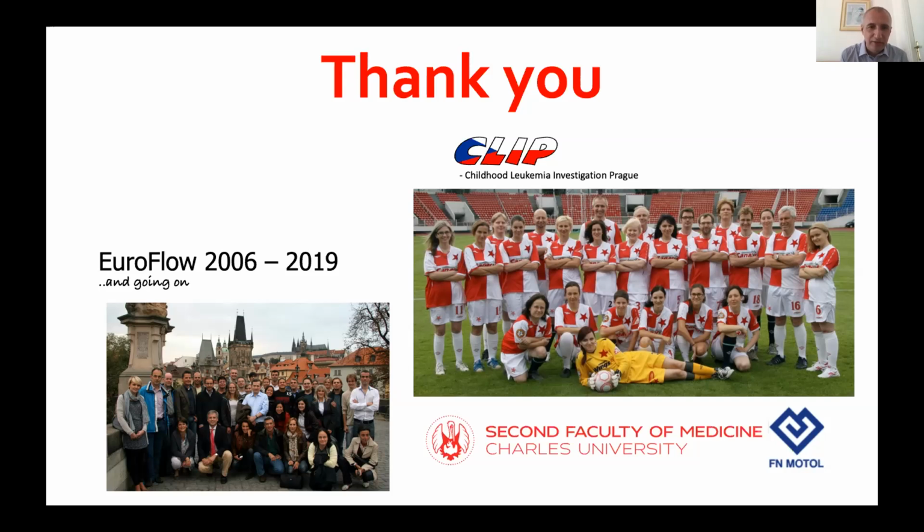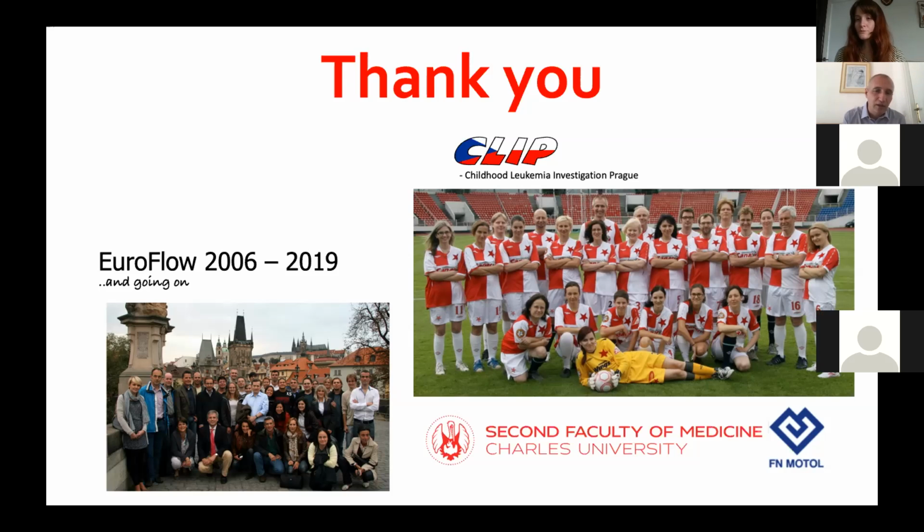Well, you are trying to get me involved in the politics here, I think. But anyway, I believe that standardization, at least the way I see it, is something that should be facilitated, that should be useful. And I'm not sure that the push for it from, let's say, regulatory authorities is necessarily a good thing, because there are many assays that are not as easy to standardize. And if you say that only things that are standardized will ever be allowed to be done on our clinical samples, this will be a big problem.